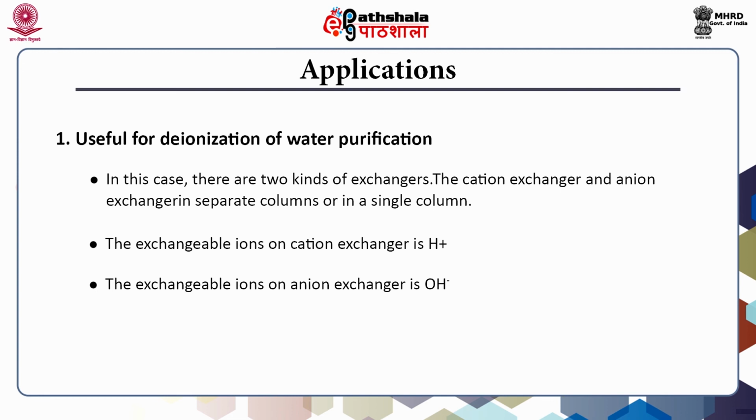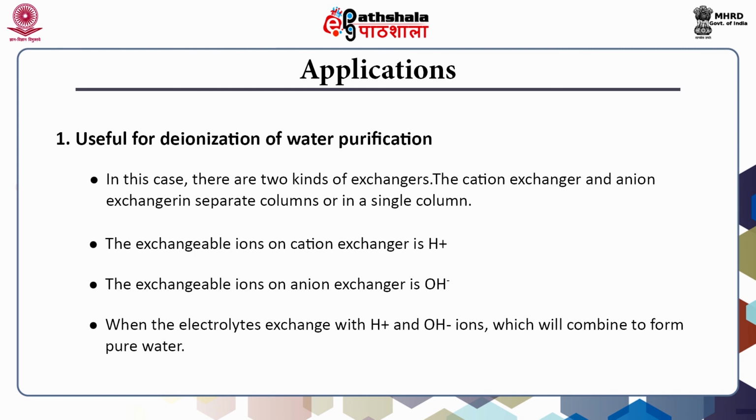minus ions. So, whenever the water comes into the ion exchangers, for example, in a cation exchanger during water purification, say sodium ions are present in the water, or in hard water, calcium ions are present. These calcium ions replace the H plus ions from the cation exchanger.